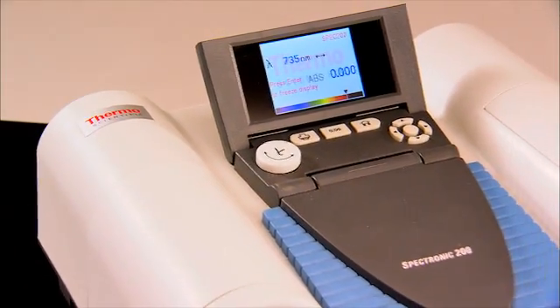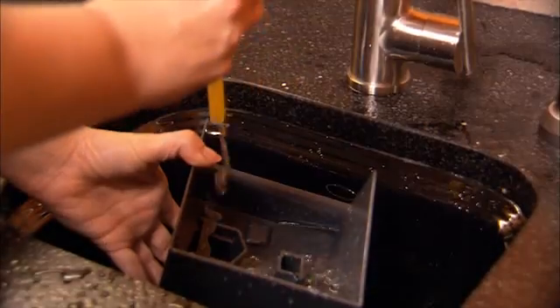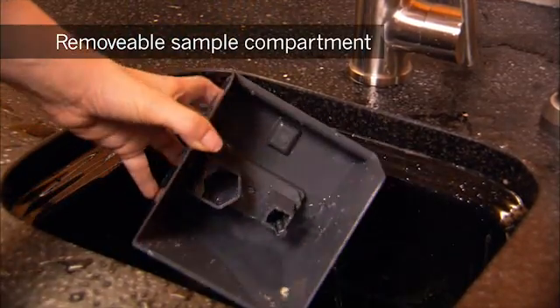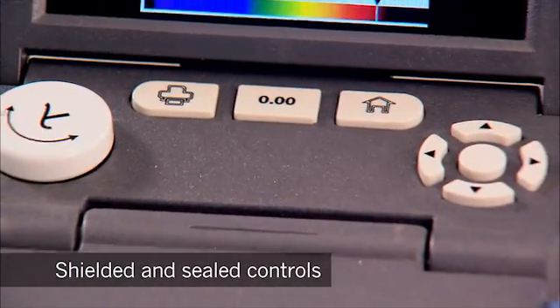Constructed of tough ABS plastic with sloping surfaces to shed spills, a unique removable and rinseable sample compartment, and shielded and sealed controls.